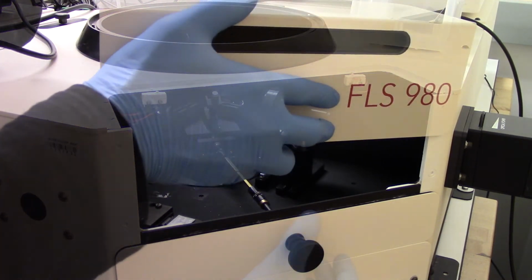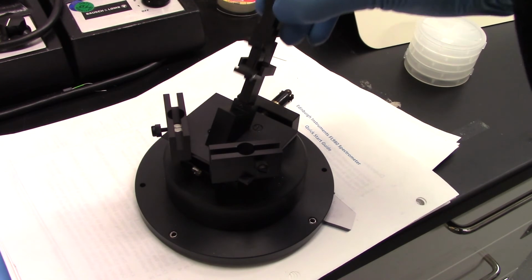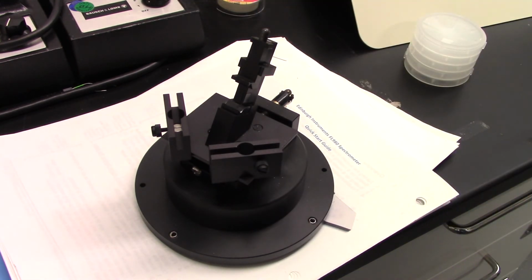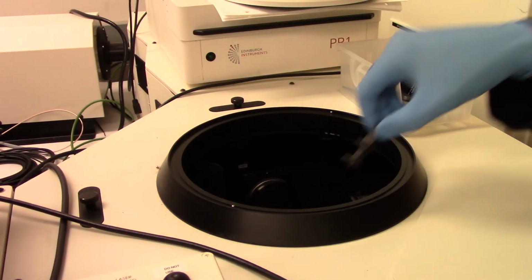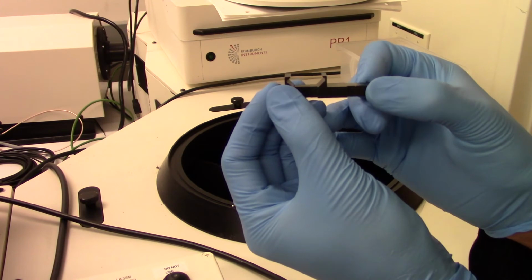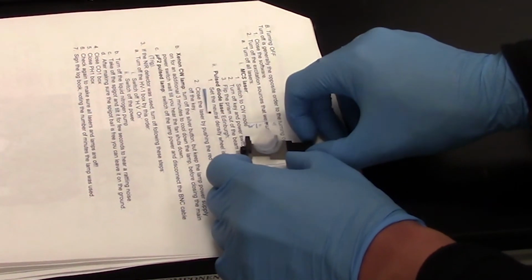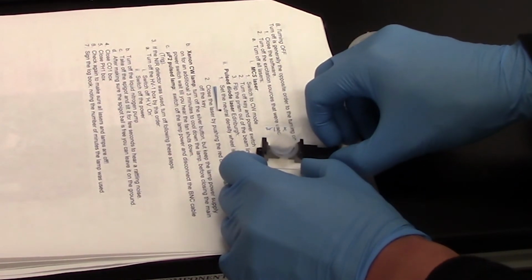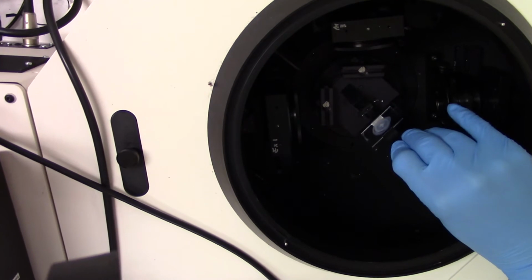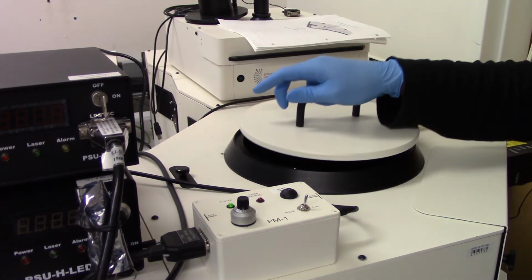You can replace the panel and close the sample chamber. The solid sample holder has a second piece that's a clip that can clip onto a glass slide or a cover slip. You can see me clipping in this cover slip that has my dried sample into the clip assembly, and then I can slide this clip into the angled solid sample holder base. Once I do that, I'll close up the sample chamber.